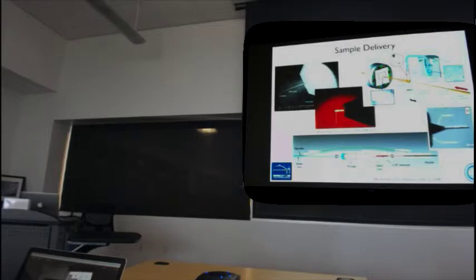Now, there are some challenges with devices like this. They need a lot of sample to run, a lot of crystals: milligrams, maybe in the worst case, grams of sample. Not so appealing for a lot of biologists who don't have that much sample to work with. So more recently, there have been developments in LCP, lipidic cubic phase, injectors designed for membrane proteins, but it turns out they could maybe be used equally well for soluble protein crystals, just as a medium to deliver the sample. This has a lot of nice properties, but in particular, very low flow rates, so a lot less sample use.